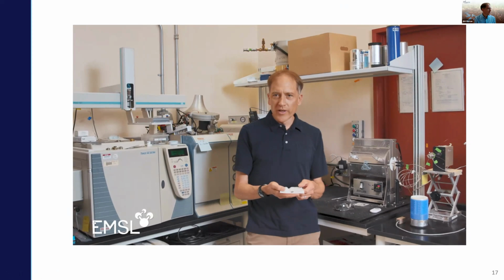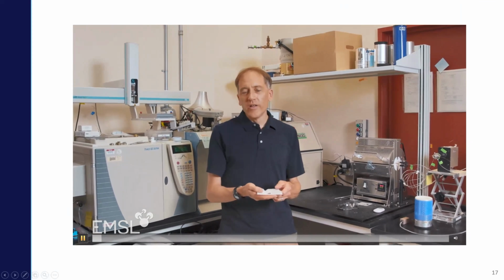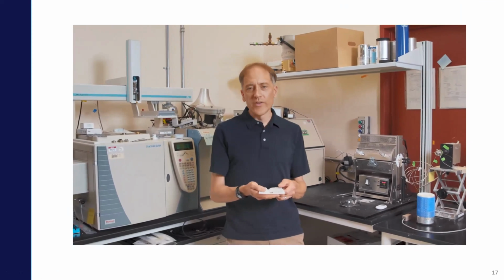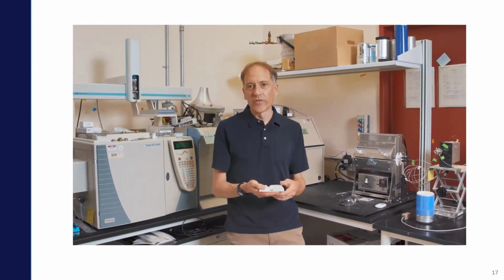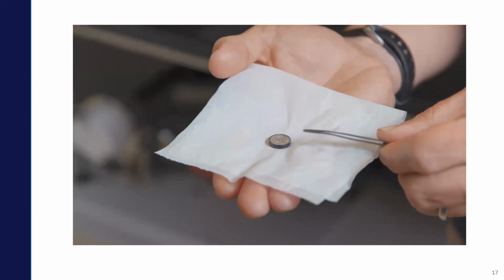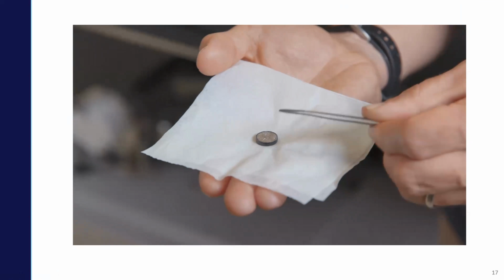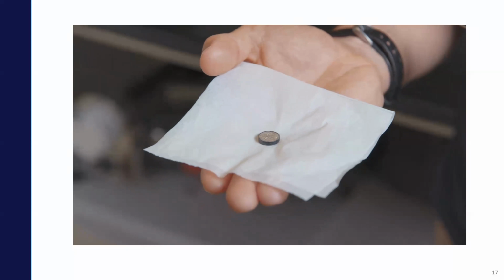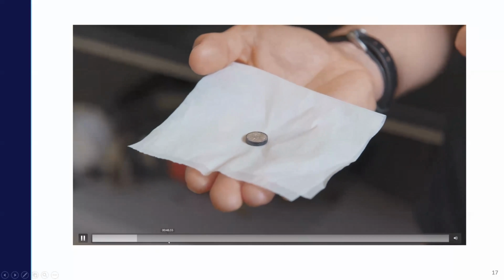And we'll try it. Laser ablation isotope ratio mass spectrometry. Good. What this capability is, is a way to get spatially resolved 13C measurements along roots or rhizosphere or even soil interfaces. Here's a sample that we've already used. You can clearly see the root going down the middle of the sample. What's harder to see are the small ablation pits on either side of the root. This is where we've already taken a number of samples for precise 13C measurement.